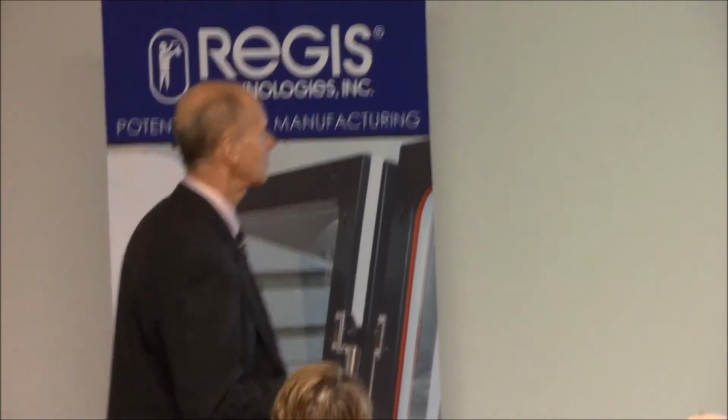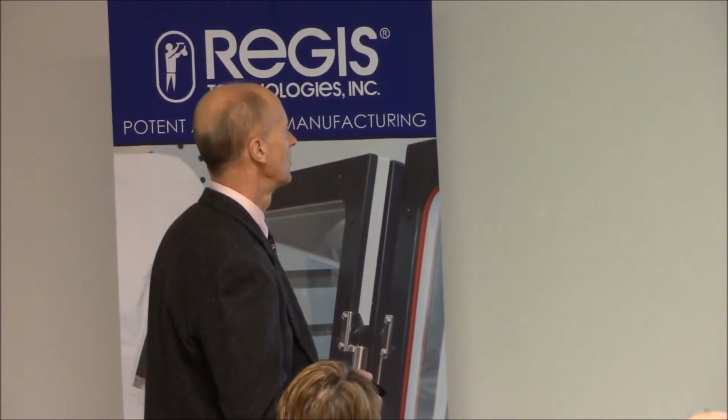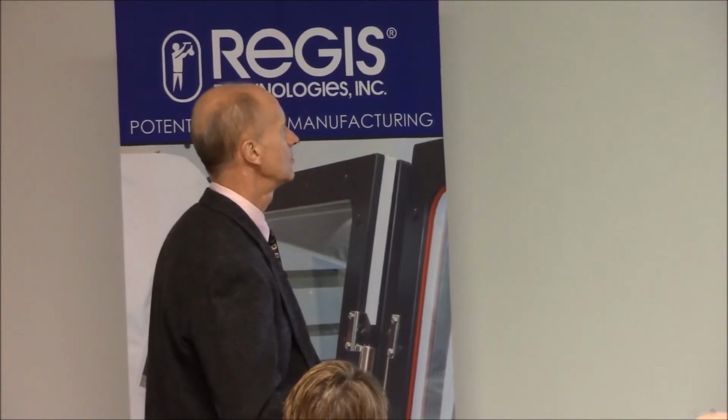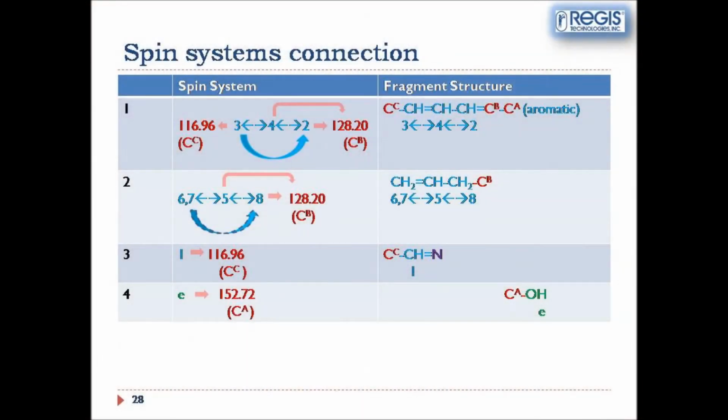In this case, it's a little bit more complicated, but it's still very well resolved. We can see that spin system 1 is connected to quaternary carbons CC and CB. So we just add them to this fragment.